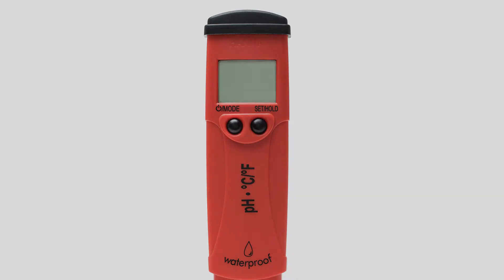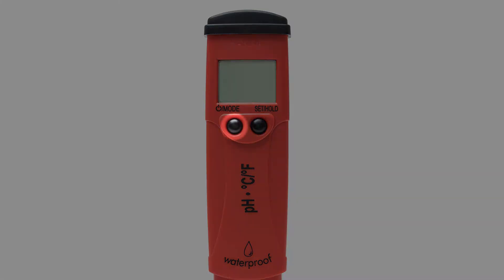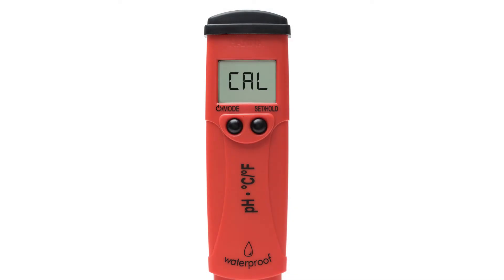To set up your pH tester, when you first turn it on, you'll see the default temperature settings at the bottom of the screen. To change your temperature settings, press and hold the mode button for six seconds until temp shows on your screen. By pressing the set hold button, you'll see the temperature units change from Celsius to Fahrenheit.